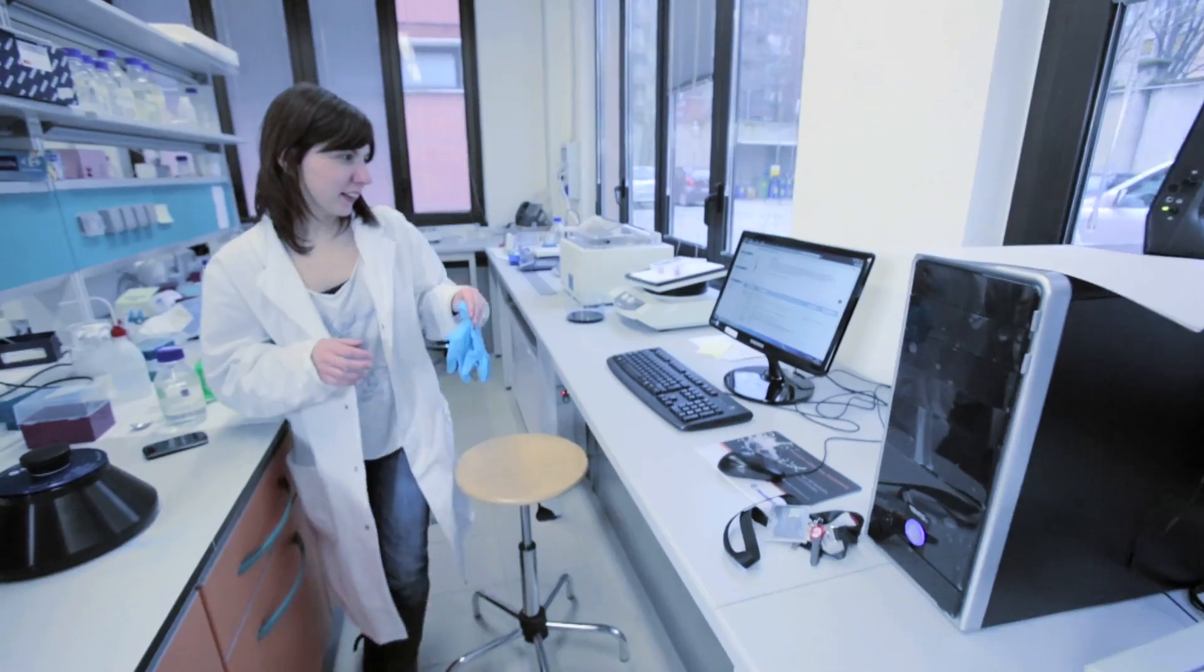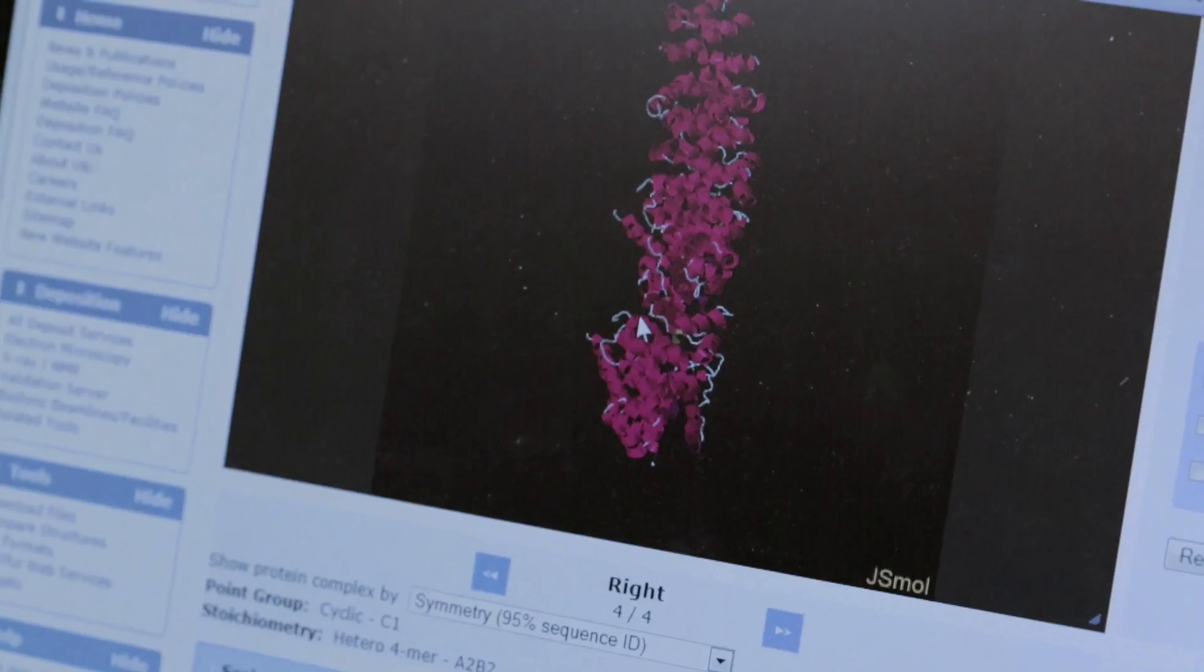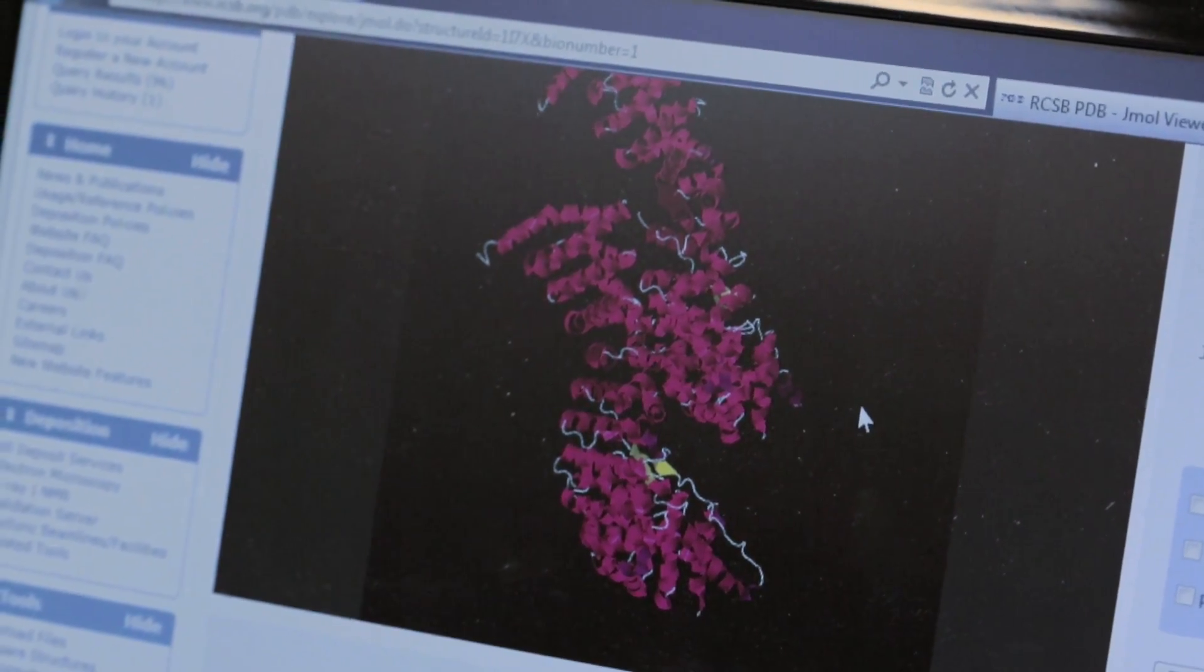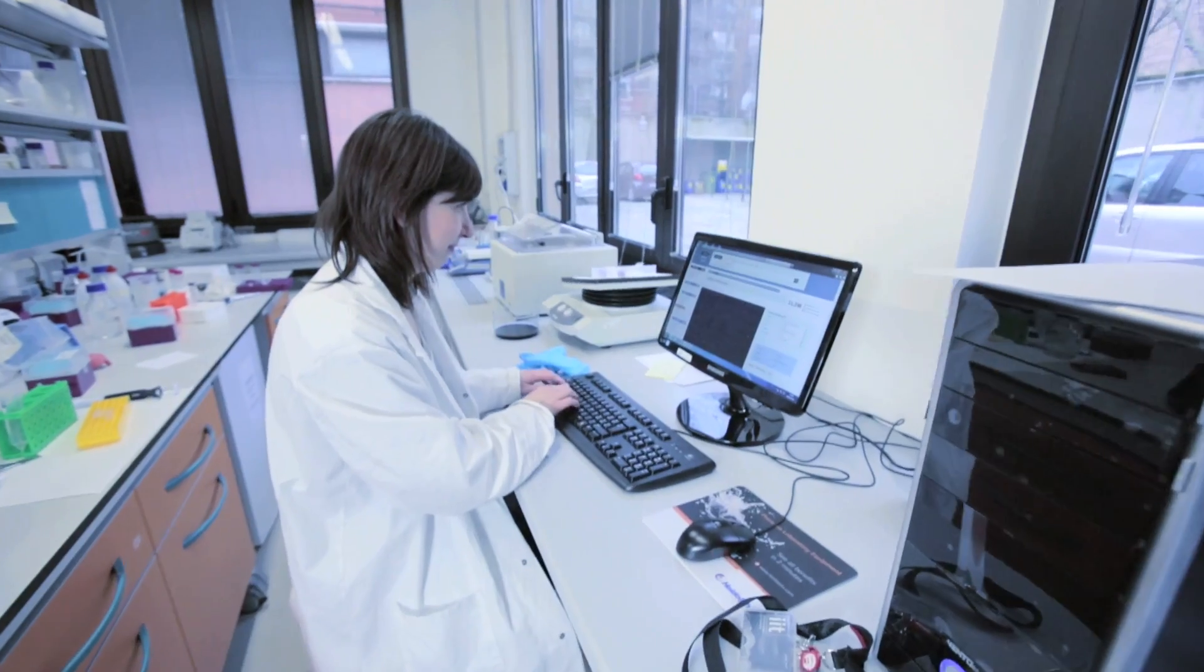After bacteria growth, in order to check the expression of the protein of interest, we can break the cells and study the expression pattern of proteins that are constitutively expressed by bacteria.